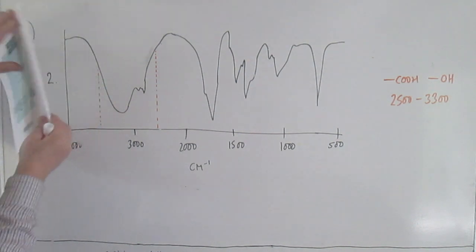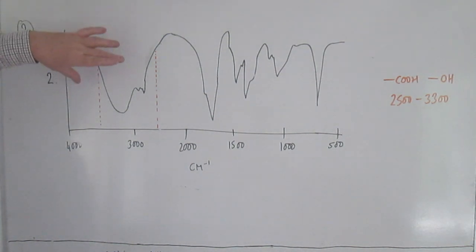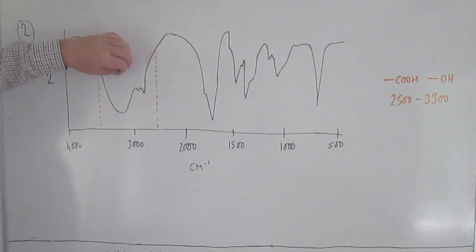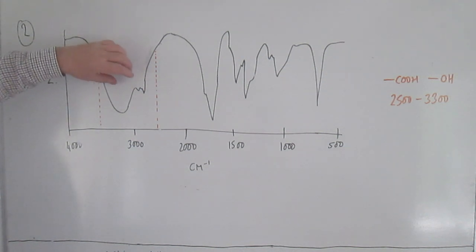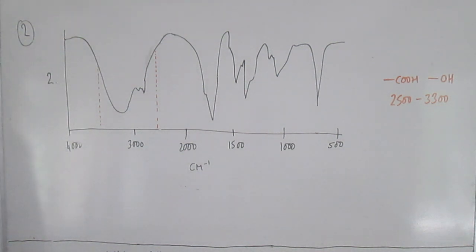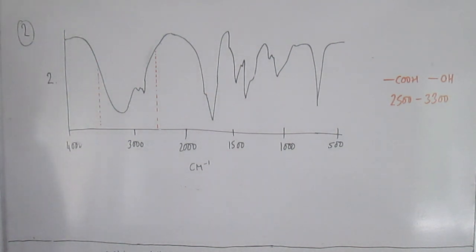You can do this for real on the spectrum, actually print it out, and you can see that again it doesn't go right to the bottom of the peak, but it basically brackets that huge broad peak pretty accurately, and so that fits. That's what you expect for a carboxylic acid OH. You can see that it swamps the CHs, and you can see them there as little spikes on the shoulder of this peak. They are still there, but they're just superimposed on this massive OH peak.